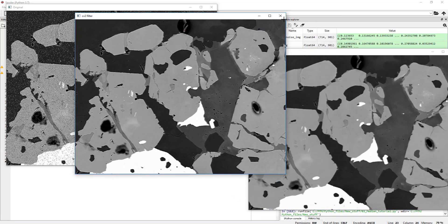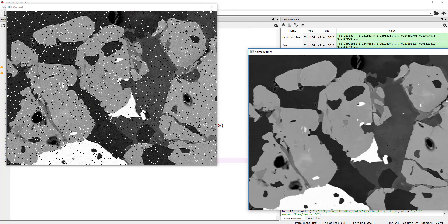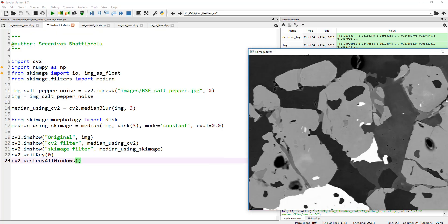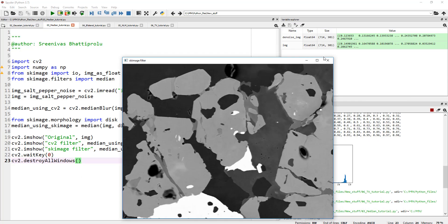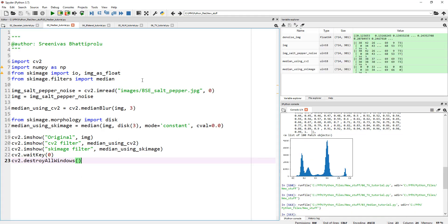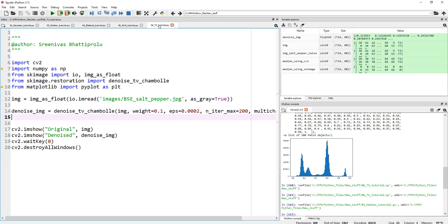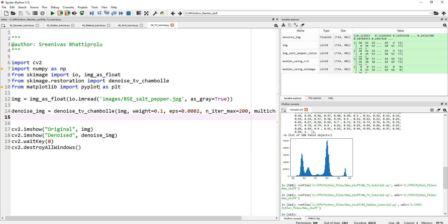Again, the Gaussian, non-local means, bilateral, and even the total variation, they all work great on this random, normally distributed noise. But when it comes to salt and pepper, nothing can beat the median filter.